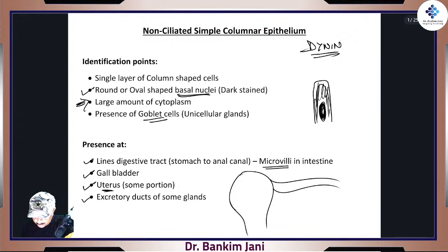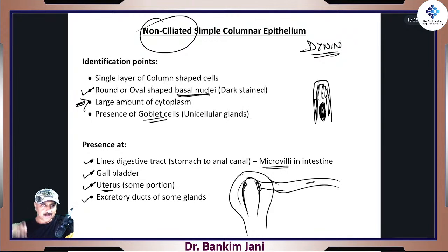And that's the fallopian tube. Over here, some portion of the uterus is not having cilia. So we are watching this cavity, right? And this opens over here. So some portion will be having that cilia, some portion will not be having cilia. So we'll watch both of them. We'll watch non-ciliated and we'll also watch the ciliated ones, right? But when it comes to fallopian tubes, you'll be mesmerized by how amazing the inside structure is, right? Let's watch. Let's start.